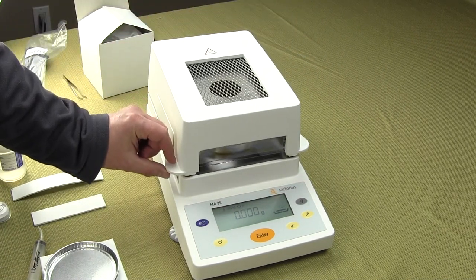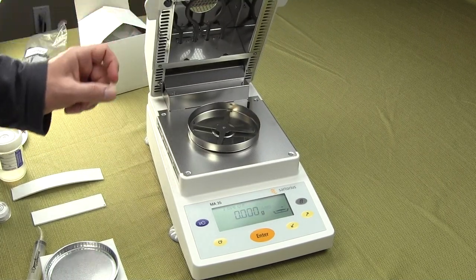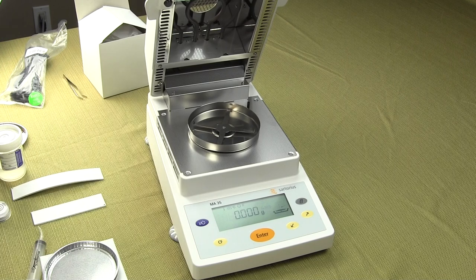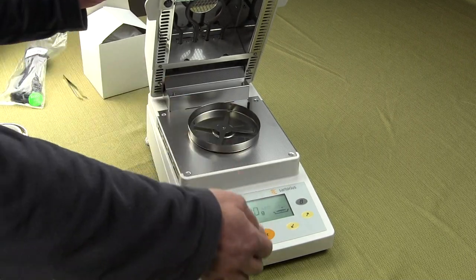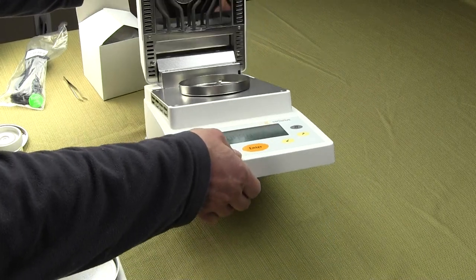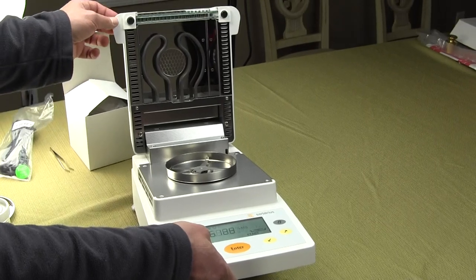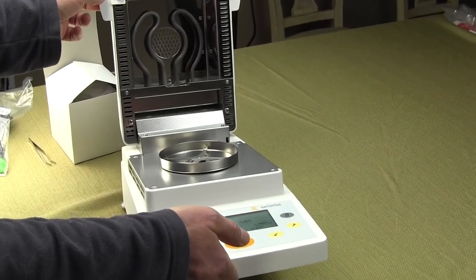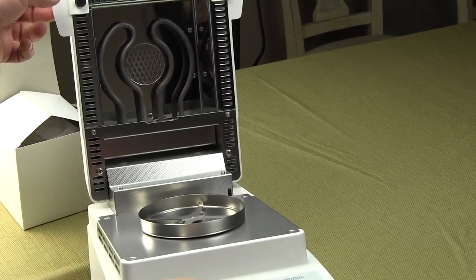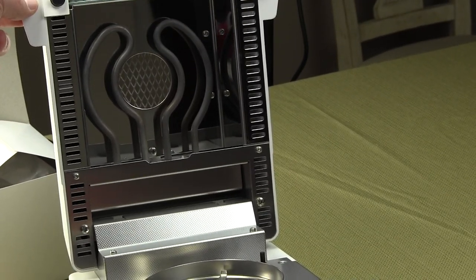This is one of our most popular moisture balances. One of the reasons why is that most competitive models on the market today use a halogen bulb and those halogen bulbs burn out. If you look here towards the top of the lid, we have two metal tubular heating elements, and the beauty of these is they have a much longer lifespan than a halogen bulb.